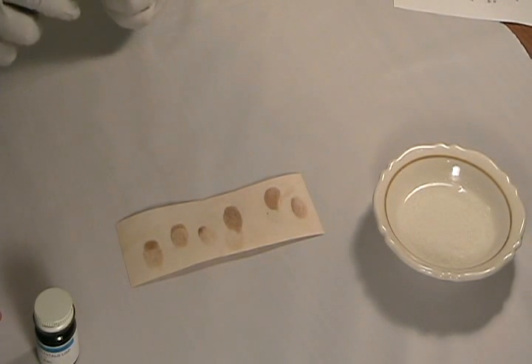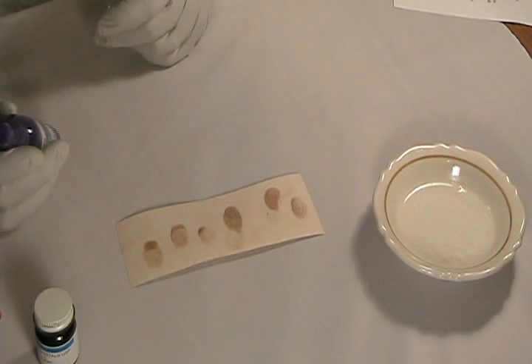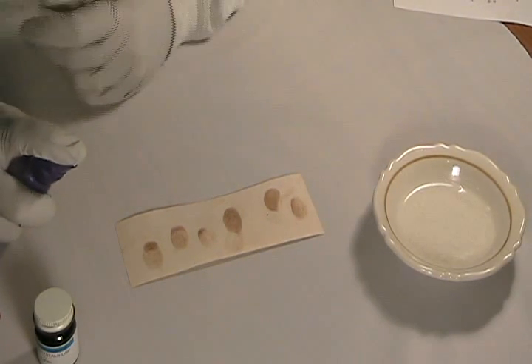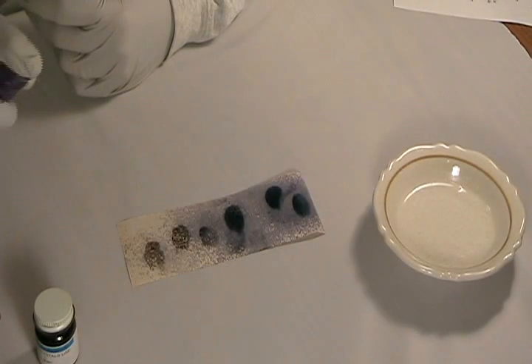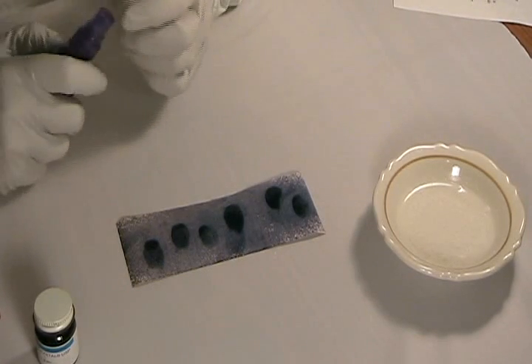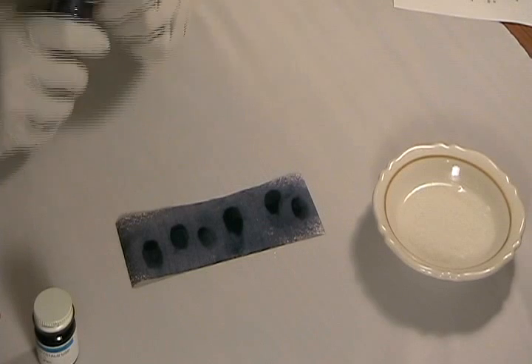However, if you do get the latent prints visible, you can make them a lot more permanent — lasting weeks to months — by spraying them with a solution of starch water. What I'm using here is some water that I cooked pasta in last night. Let's see what happens when we spray the prints with pasta water. As you can see, they immediately turn a deep blue-black, and at this point they can be preserved, photographed, used for evidence, or whatever.